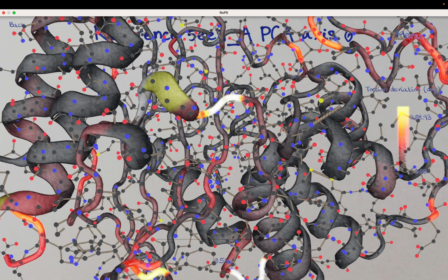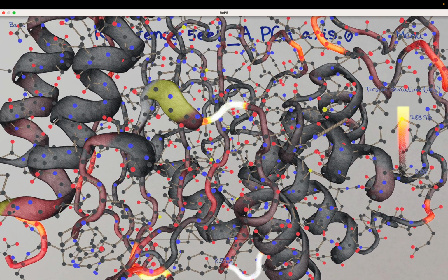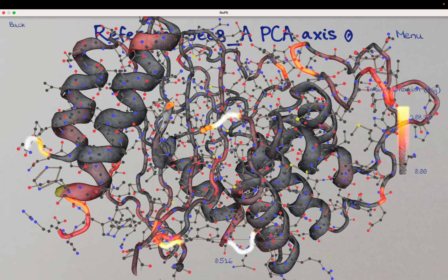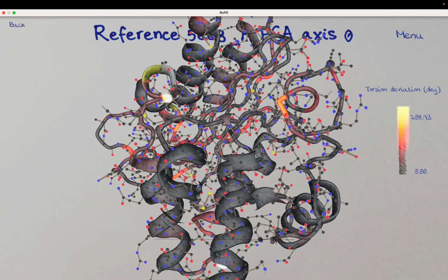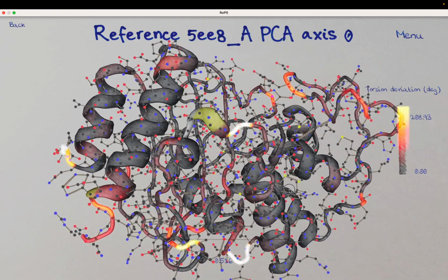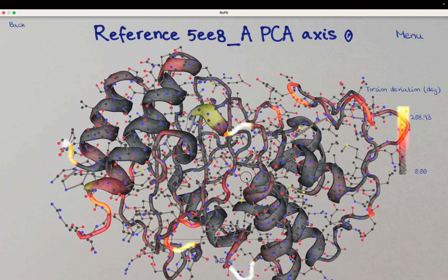In this case, it's easier to see the atoms if we slab differently. So again, with the Qt conventions, if we press and hold the D key on the keyboard, then we're going to see much less of the protein. And we can fiddle around with the alignment of the protein molecule in order to see the loop of interest more easily.